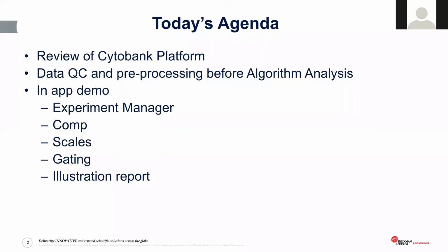Then I will move on to the demo in-app with some demo data. I will focus on the data management aspect of Cytobank and also show you the basic tools needed for data pre-processing and illustration report. This session can serve as the basic foundation for the downstream data analysis, especially for those interested in the machine learning algorithm session that we will have in the next 2 weeks.